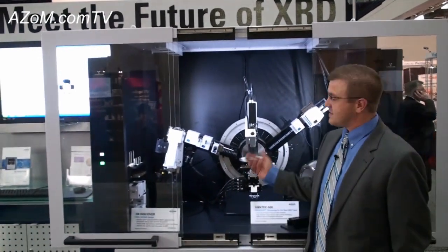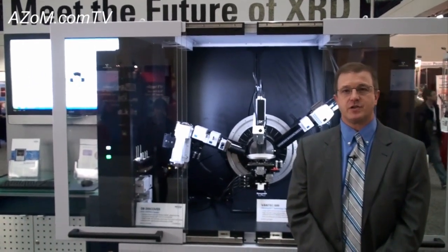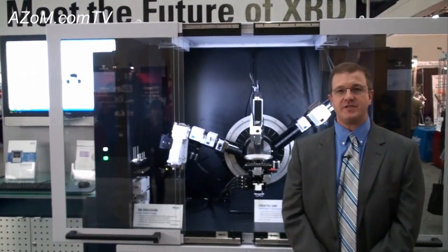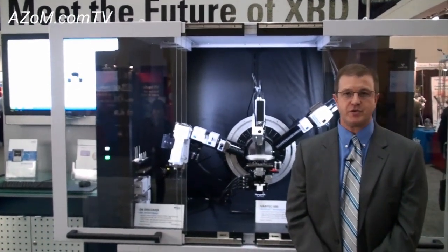The D8 Discover with DaVinci diffractometer is our flagship for materials characterization. It can handle anything from thin film, semiconductor materials, all the way through rocking curves, reciprocal space maps, nanomaterials, and pair distribution functions.